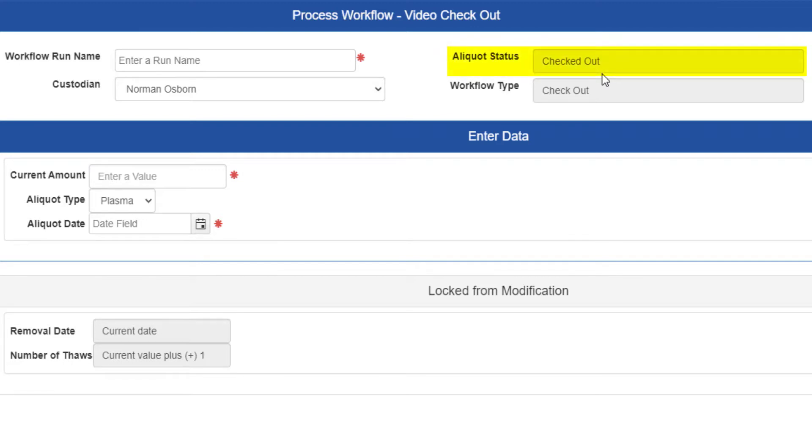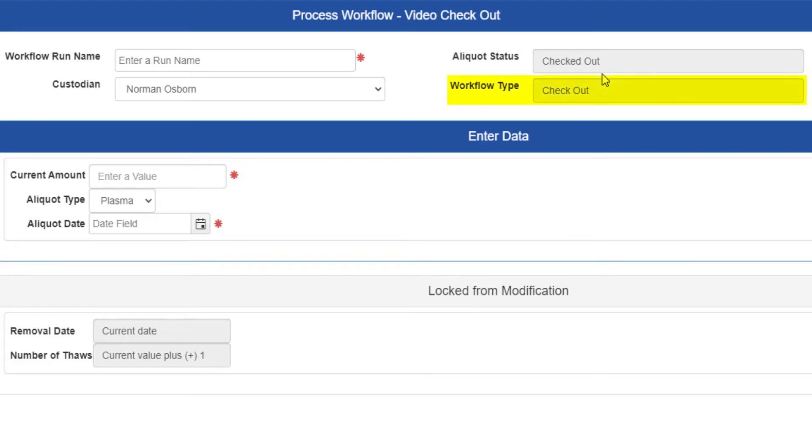Take note of it though, and make sure it's set correctly for what you're doing. Aliquot status can have major ramifications on what you can do with aliquots later. The final dropdown, workflow type, just tells you what workflow type you chose, so we see checkout. It also isn't modifiable.